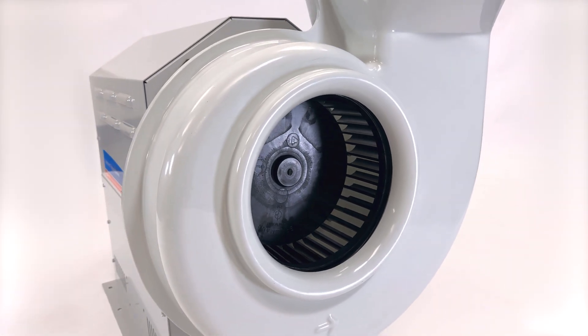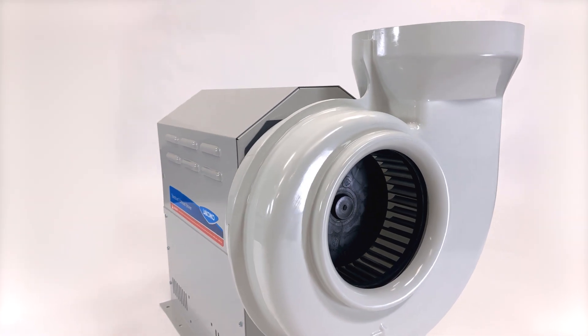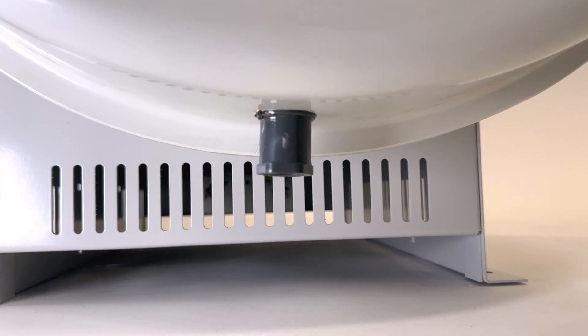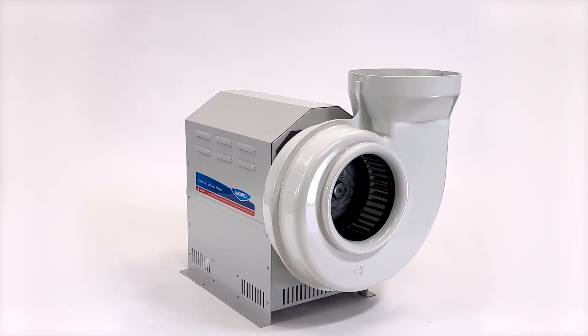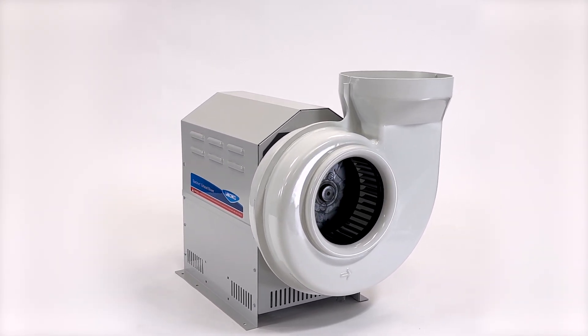A PVC model is available for highly corrosive applications and includes a drain plug, making it the ideal blower for applications involving a washdown, like perchloric acid applications.